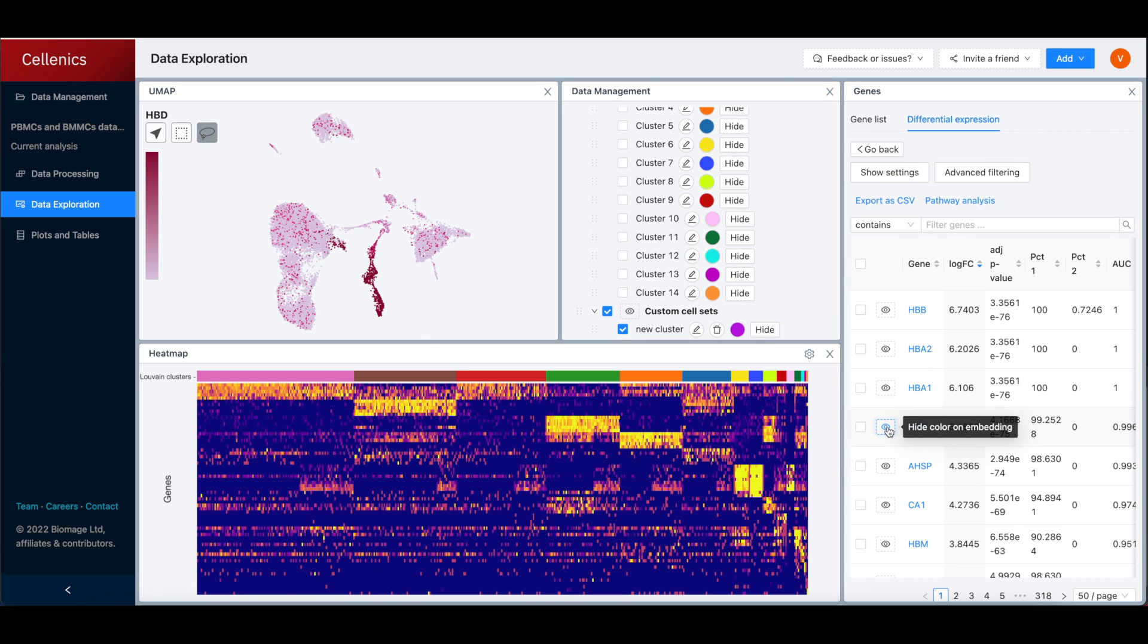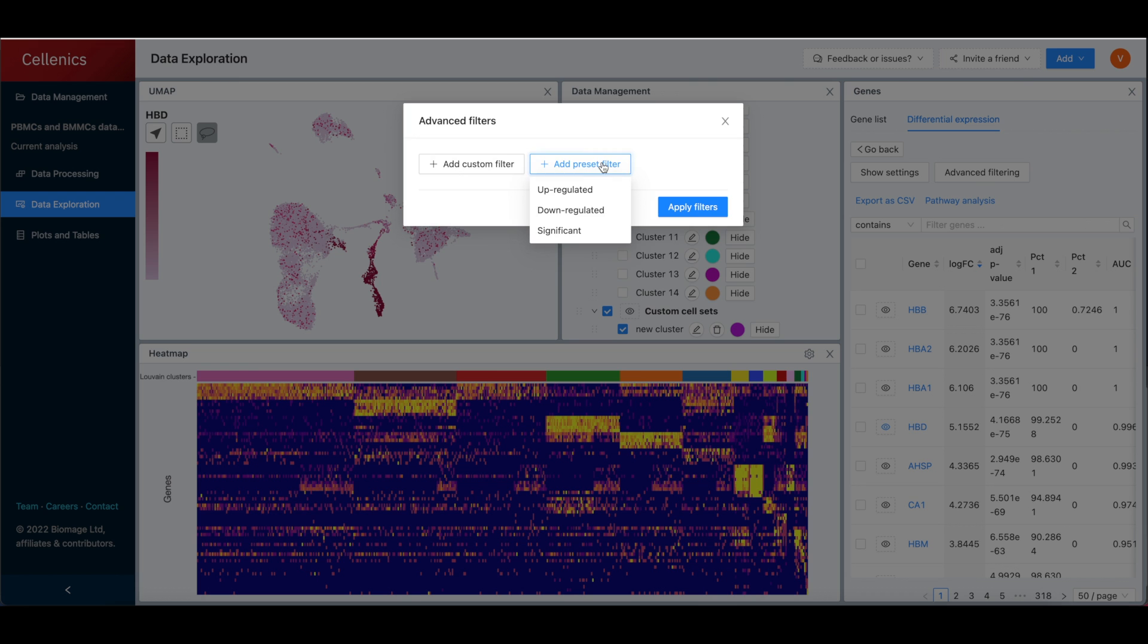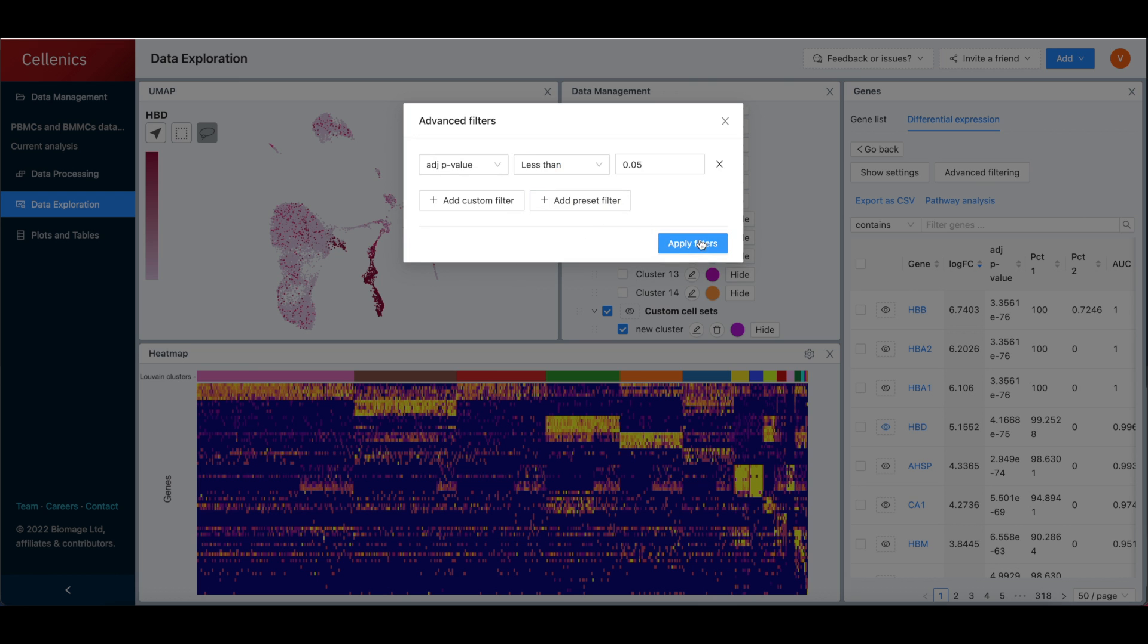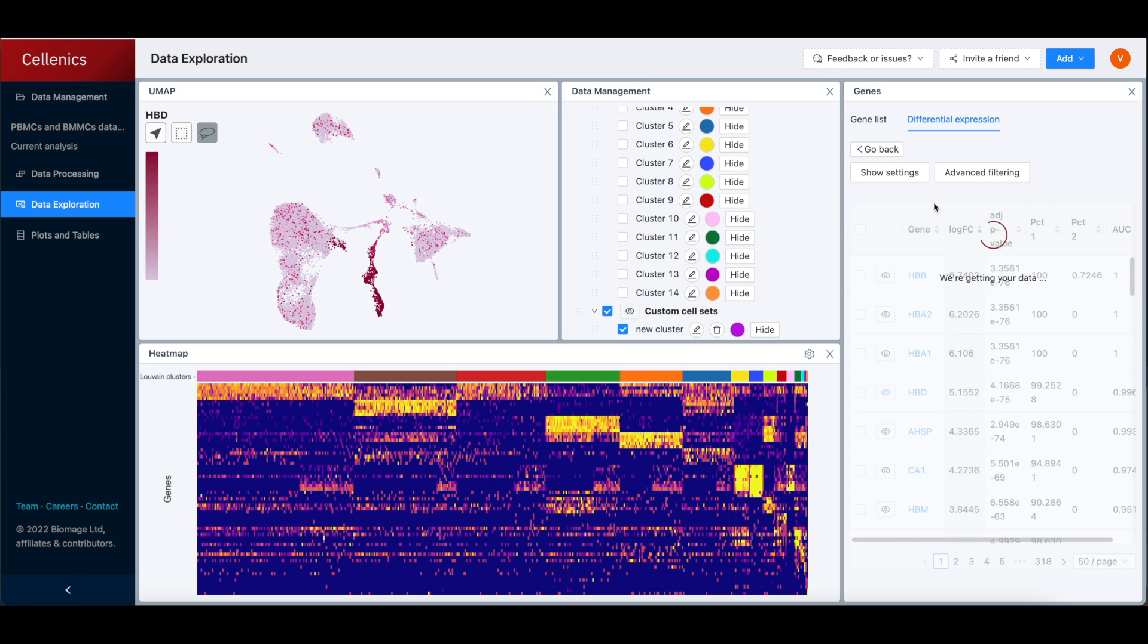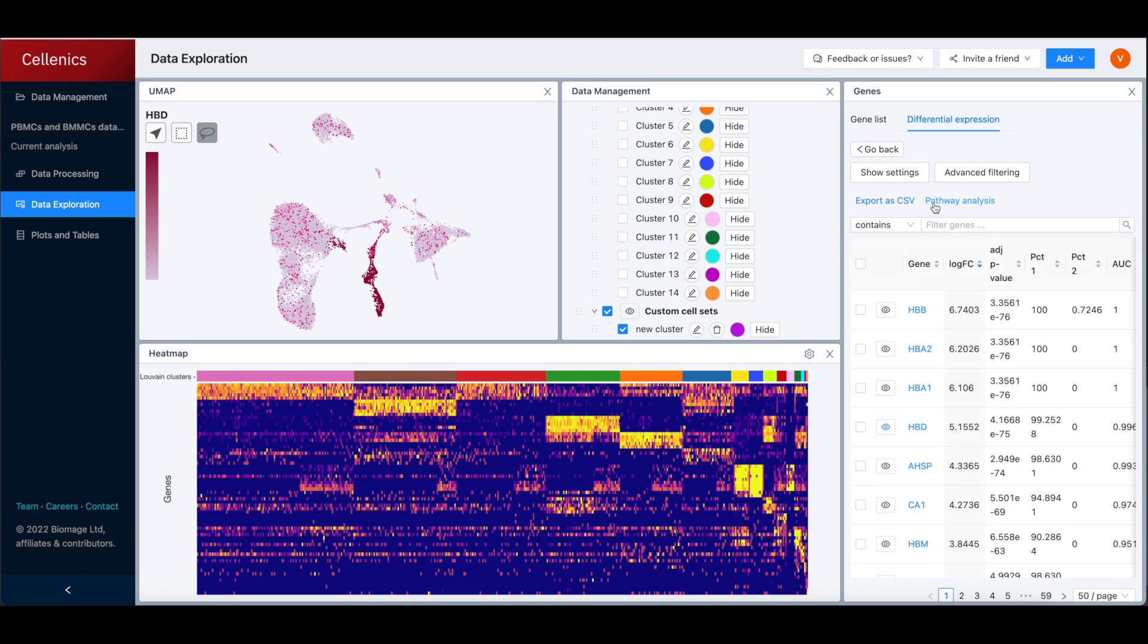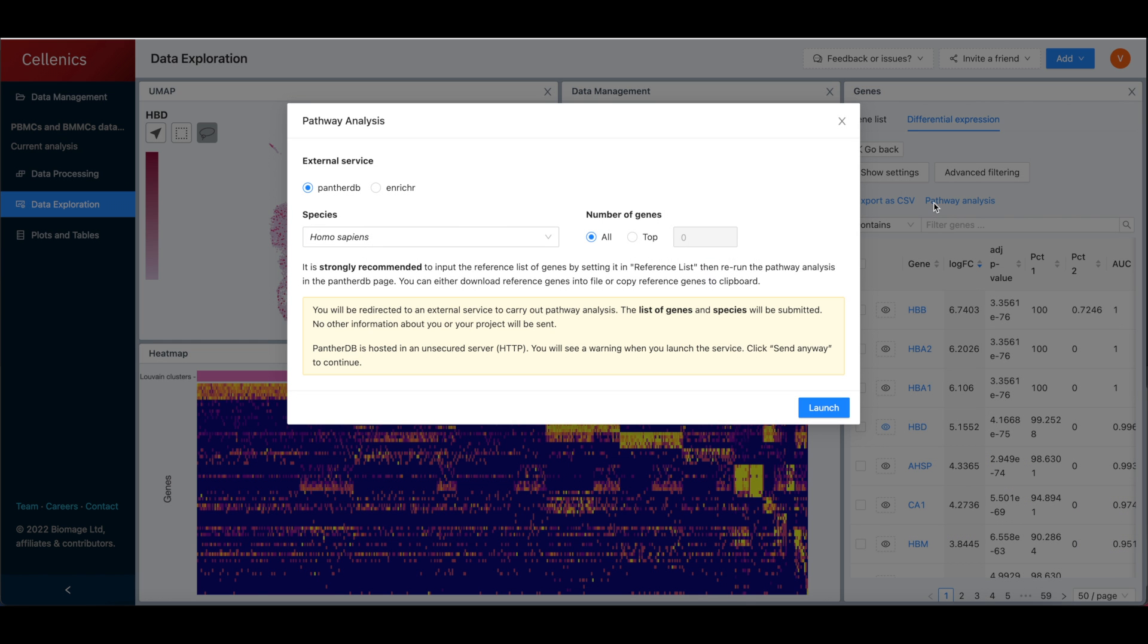Gene expression is easy to view on the embedding and heatmap, while differential expression and downstream pathway analysis is fast to calculate and explore.